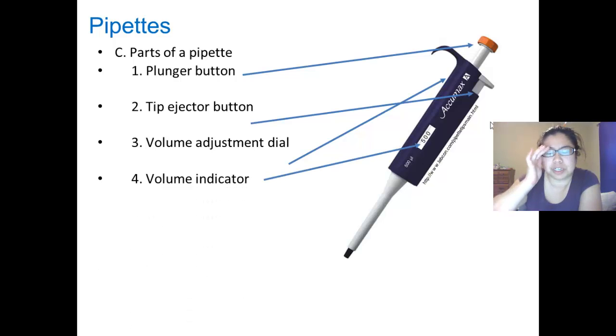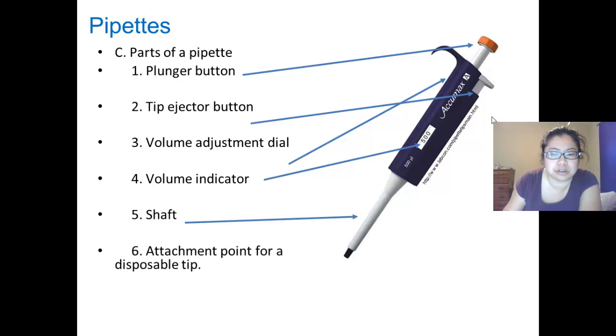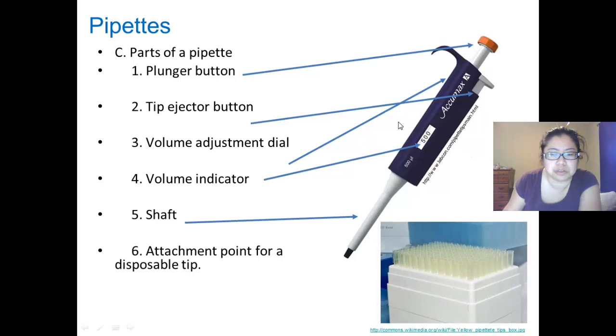Then we have a volume indicator that tells you how much liquid you want. And then there's the shaft where it delivers the air and vacuum, and the detachment point for the disposable tip here. And there's the box of tips.